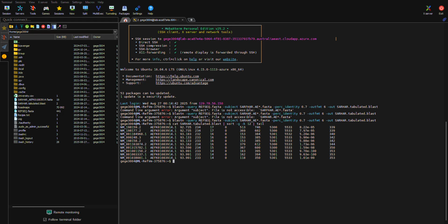So it looks like quite a few of you are already at finding the name of the gene. How can you find the name of the gene in the file, right? Well, I would recommend that you search the file for whatever accession number you found, but leave out anything after the decimal place. This is the first part of the accession. You can do that via a grep function. You can open the text file and just search for what you're looking for. You can move the gene names file to your computer and just open the text file and search that way as well.